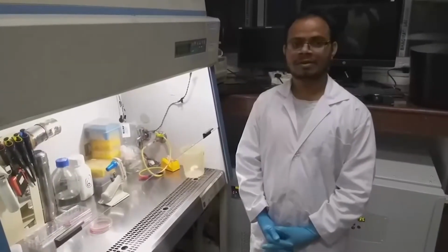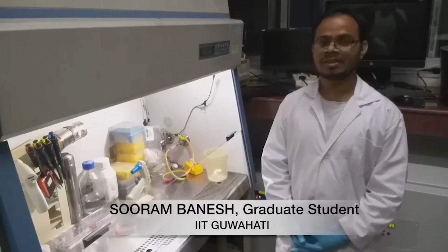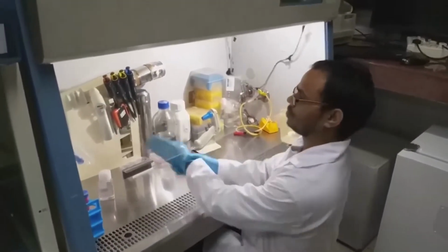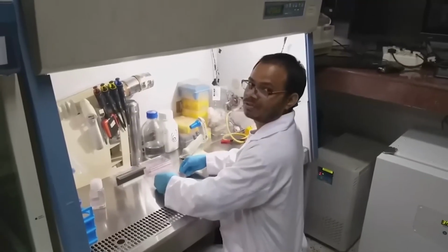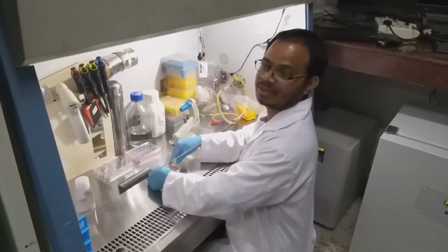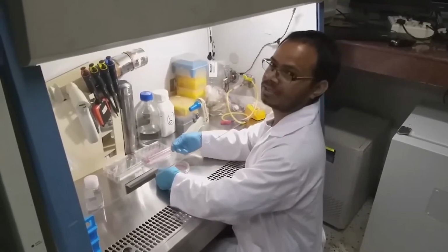Hello everyone, in this video we will show how to subculture the cells and count the cells. First we have to remove the remaining media, then trypsinate the cells, then we will count the cells and see it. Now I will show how to do trypsination.